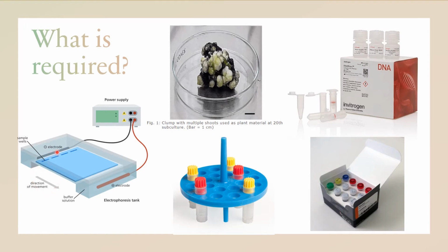So when you put the DNA inside the sample well here and you run the power supply, the ions will move from negative to positive, and so will the DNA inside the well. The DNA inside this gel will move from this side to this side. How it moves follows its size. The bigger the DNA is, the slower it moves inside the agarose. Smaller DNA will move faster, just like humans, just like all other stuff following gravity: the lighter you are, the faster you move. It's the same principle here with the DNA.